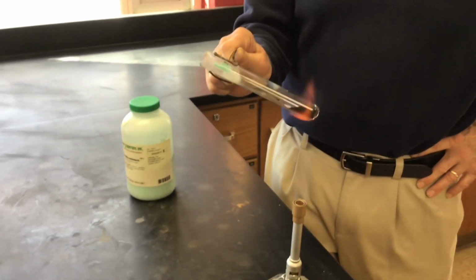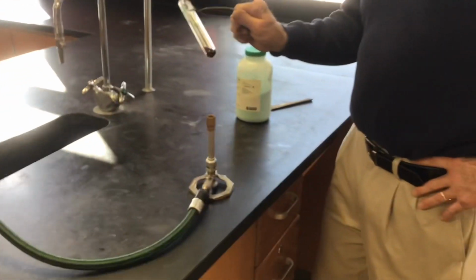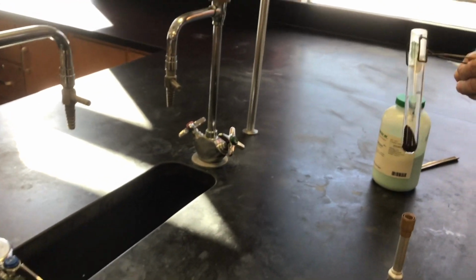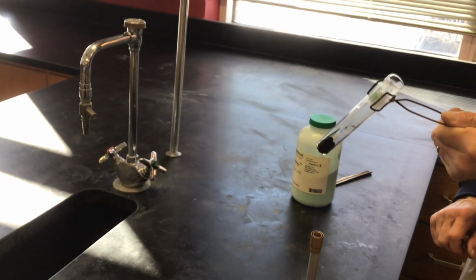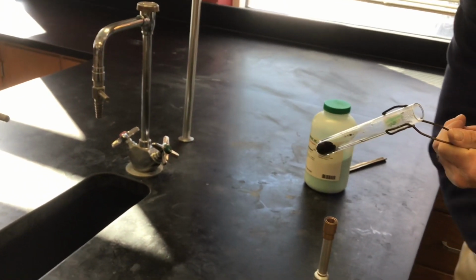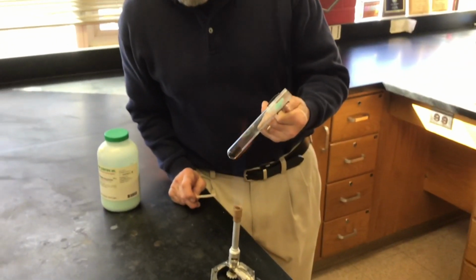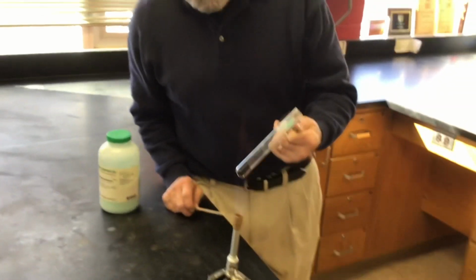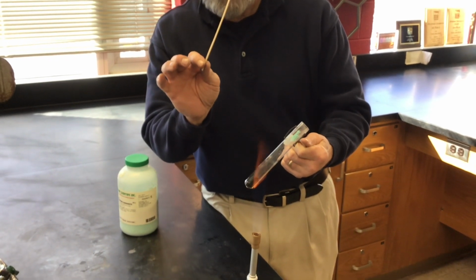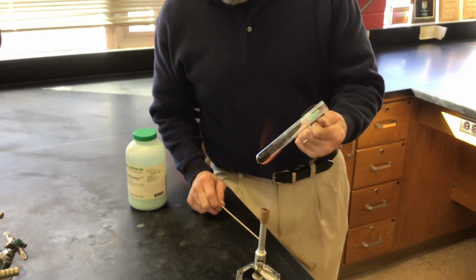Now this burner, ideally this would be a little hotter flame. So we're letting it heat a little longer maybe than normal. Now I wonder what the products are. This is a carbonate compound. So what we're going to do to test and see what might be in the test tube now that wasn't there earlier, I'm going to take a wooden splint and we'll catch it on fire, and we'll stick it down in the test tube and see what happens to the flame.